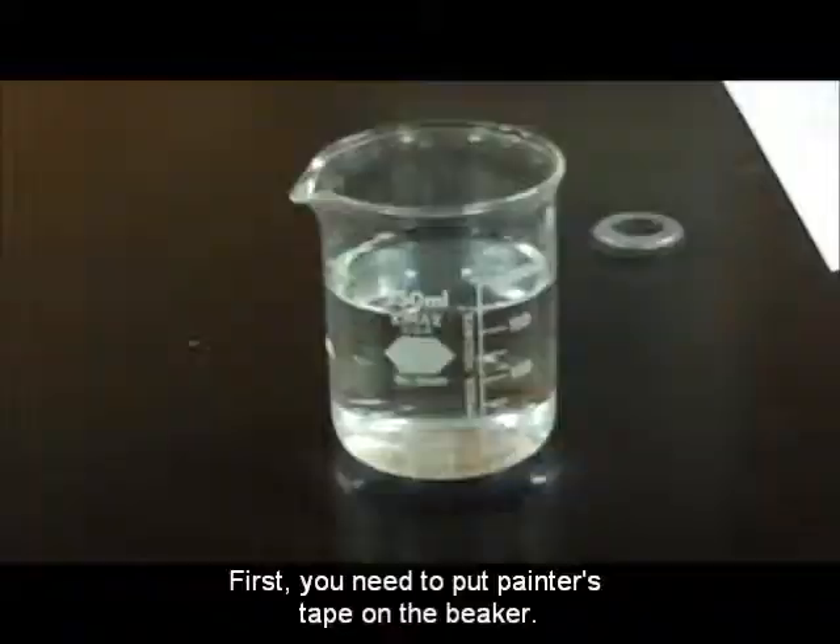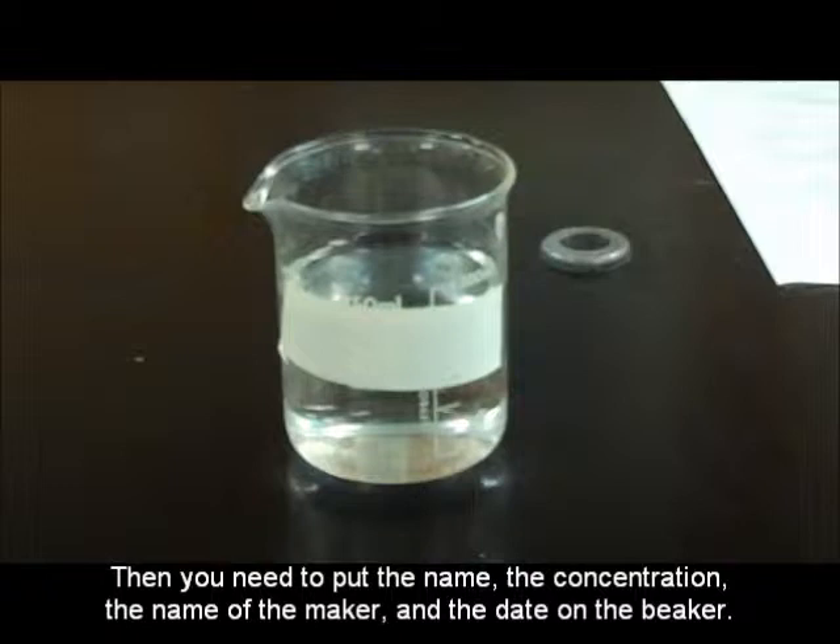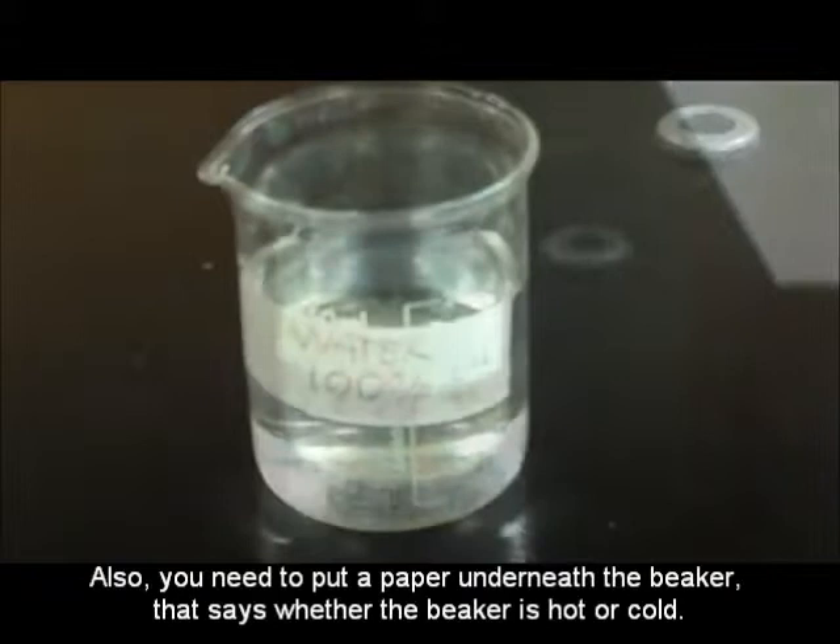But how can I make a label for the bottle? First, you need to put painter's tape on the bottle. Then, you need to put the name, the concentration, the name of the manufacturer, and the date on the bottle. Also, you need to put a paper under the bottle that says if the contents are hot or cold.